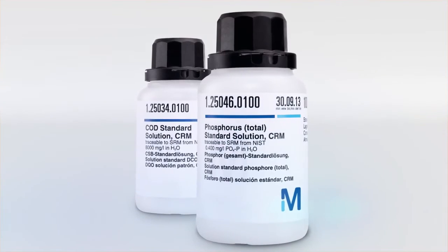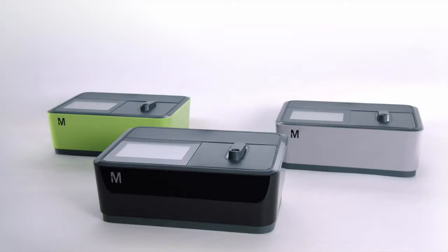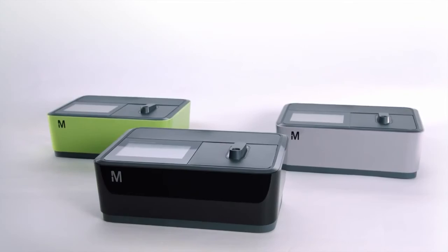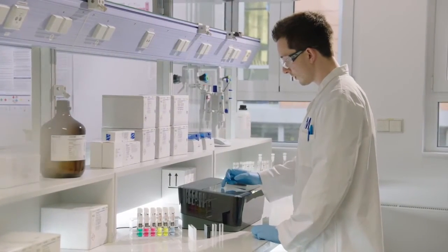All CRM standards and CombiCheck solutions offered for AQA tests are pre-programmed on Spectroquant Prove. The instrument supports and guides you through each test to ensure the security of your analytical results.